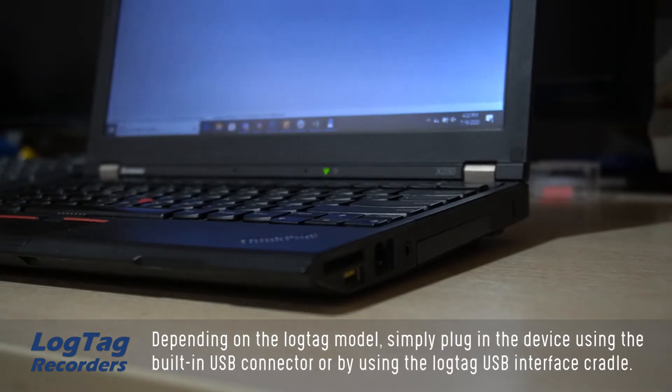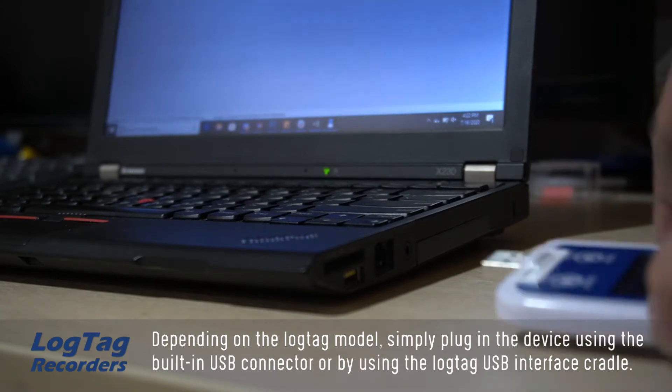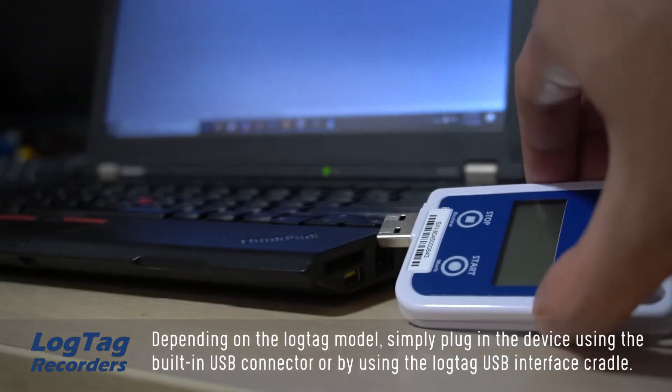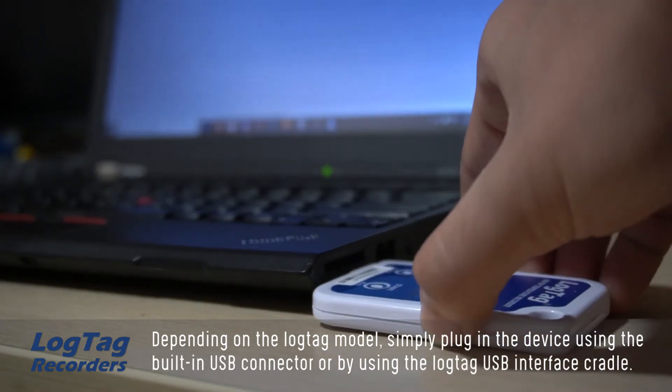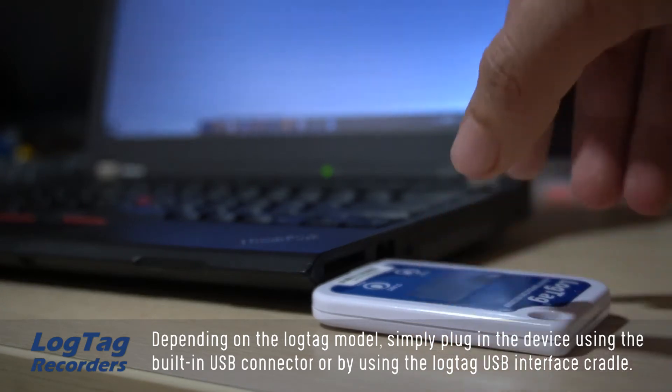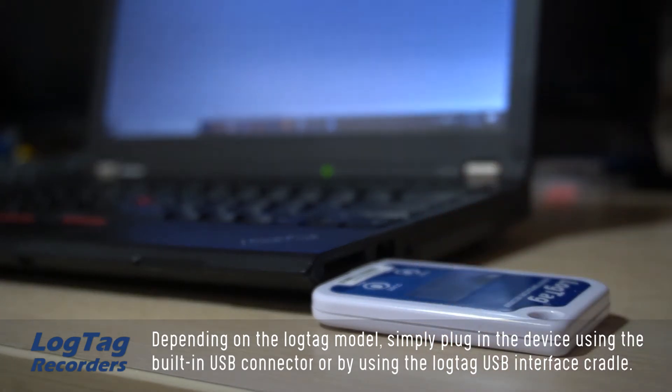Depending on the LogTag model, simply plug in the device using the built-in USB connector or by using the LogTag USB interface cradle.